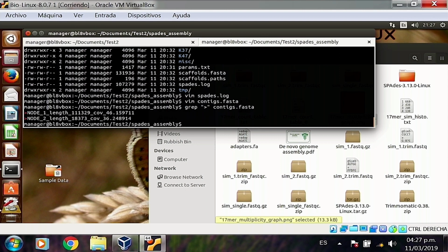In my case, it's not going to be the same for everybody, I only got two results, two names. Node 1, length something, coverage something. Node 2, length something, coverage something, right? Did anybody have results different than 2? More than 2 lines as output? Or did anybody get just 1 line as output? Basically, this is telling you how many sequences you have in your file, because you know that there are this many names.